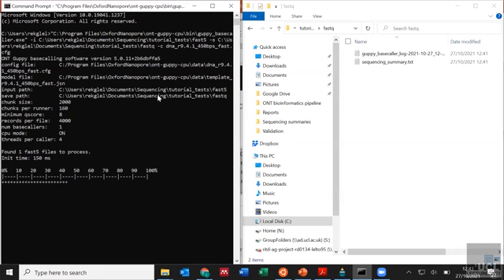So you can actually see it's telling you information about your file anyway. So records per file, 4,000. That's the default amount of reads that I mentioned before that MinKNOW puts into each different fast5 file. So you've got 4,000 reads within each fast5 or fastq file. So you'll probably get hundreds of fastq files from each barcode. But remember that within those, you will then have 4,000 reads. So you've got basically 100 times 4,000 or 200 times 4,000. So it's quite a lot of data that you're getting.